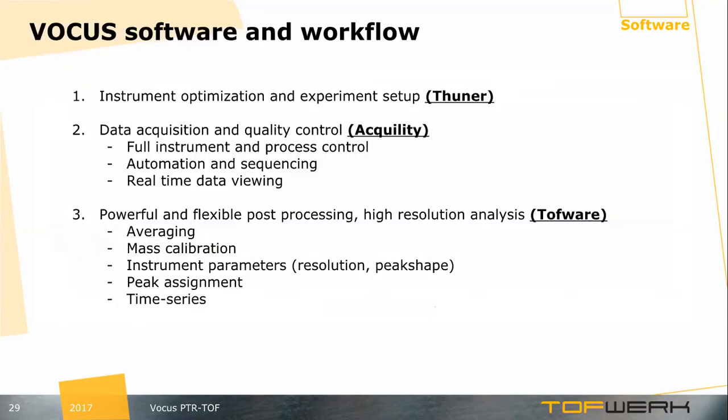So making measurements and instrument stats are very important when you're trying to decide how to make a measurement or what instrument you should use. But equally important is how easy it is to look at your data. Because even if you could collect great data, it requires post-processing. And this is a very important part of the analysis process.